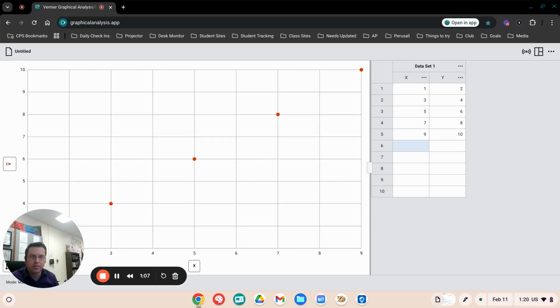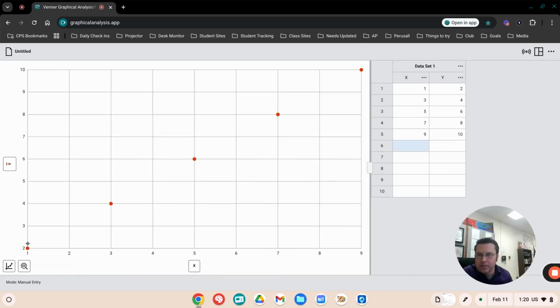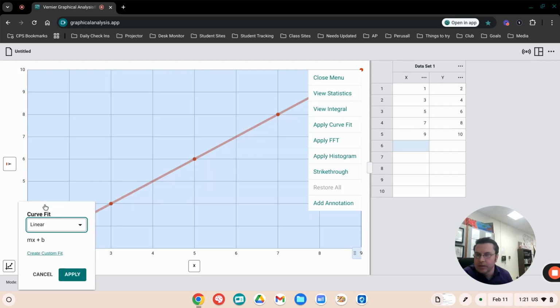it plots it. And then what you'll see is it makes a decent line. Typically it is going to be linear, so you should be able to look at it and see a definite pattern. For us, it's typically going to have a nice straight linear pattern, or it might curve and then it's quadratic. But you should be able to clearly tell a difference. If you can't tell a difference, you might want to ask or err on the side that it's linear.